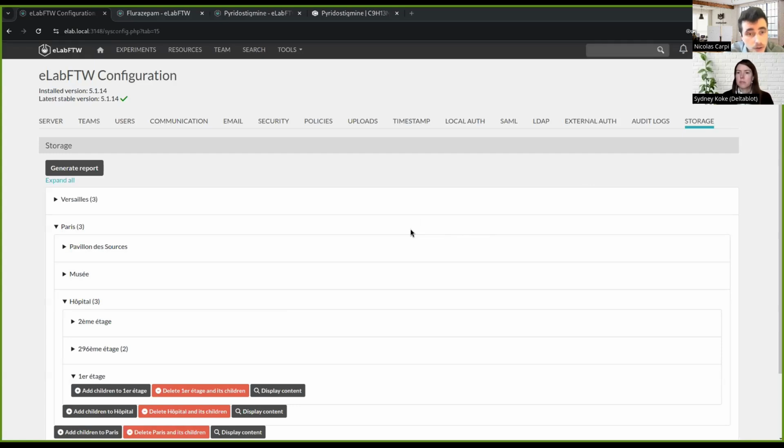The change log will just list all the operations that happened on a container. So for the moment, we don't have the history of what happened. Yeah. And I think it will be especially important for dangerous products.